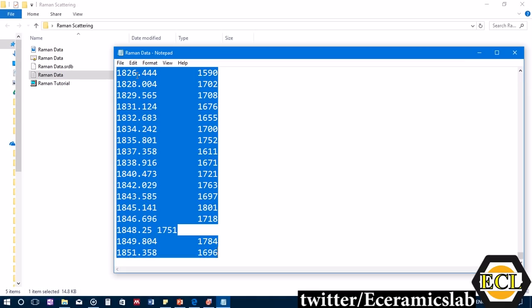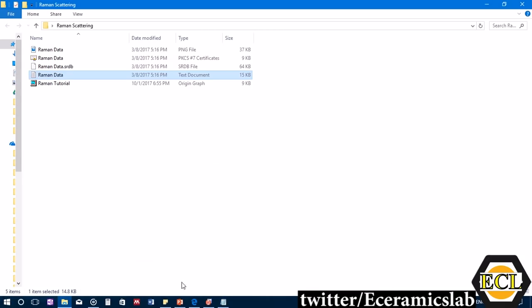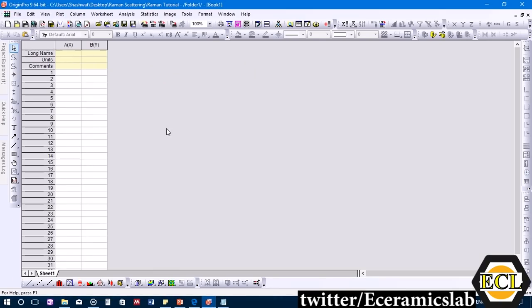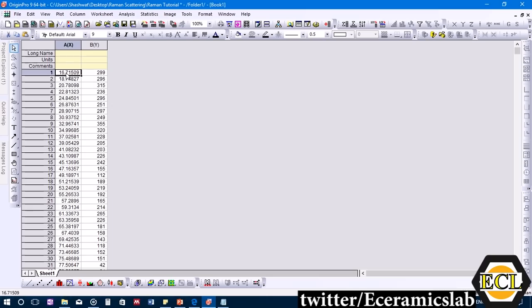We press Ctrl+A to select and copy the data, then paste it into Origin software by clicking on the first column and pressing Ctrl+V. The data is now imported into Origin.